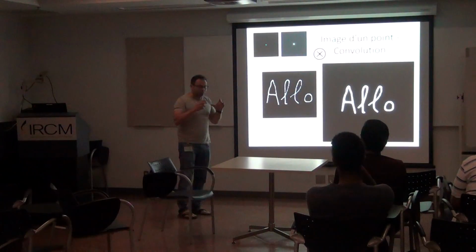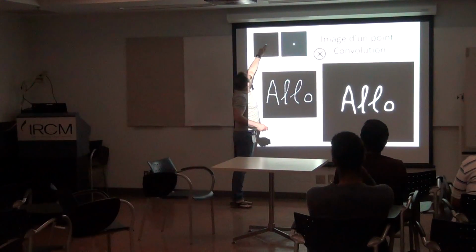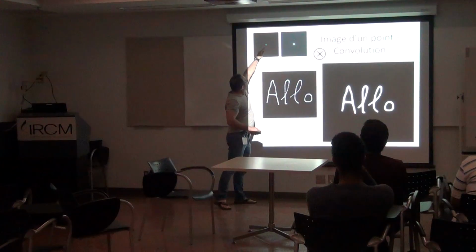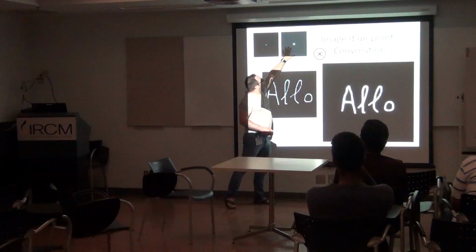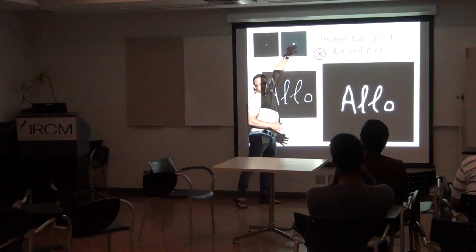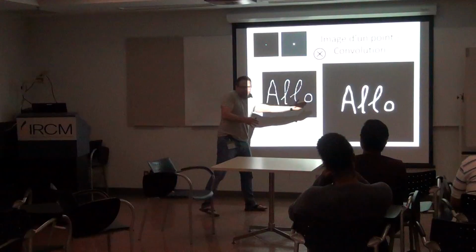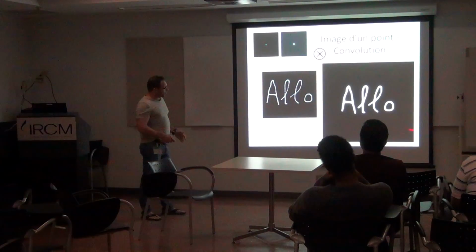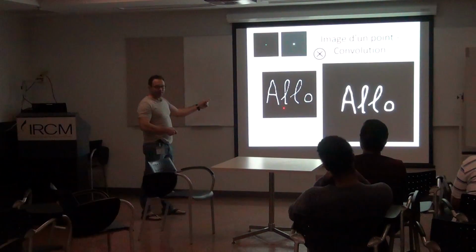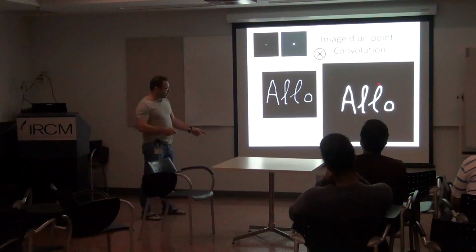So when you look at the microscope, it's not as obvious as this, because it looks like this. And here you almost don't see the rings, because you have a big spot here, and already here the image is kind of intensified to see the rings. Okay? But when you look in a microscope, you're going to see things like that. So this is the image that you acquire, but the real object is this. Okay? But what you see is this. So when you get an image, you see this.